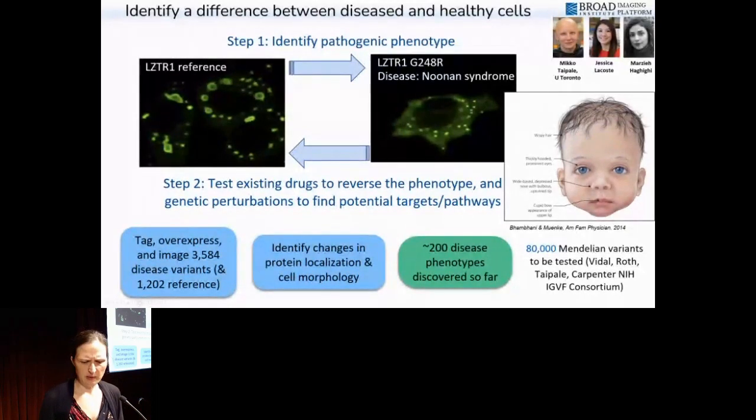And we've done an experiment that I think I didn't include in the talk today, using the same basic approach with lung cancer alleles, and it's beautiful. You see all the constitutively active mutants grouped together, and all of the loss of function ones will group together as well. So it's a really cool approach, and very non-gene specific. Normally, if you wanted to do this kind of an experiment, step 1, figure out what the gene does. Step 2, make an assay for the gene, and then step 3, look to see what the mutant does to that assay. But here it's just the same assay across hundreds of genes. Yeah, thanks for raising that point.